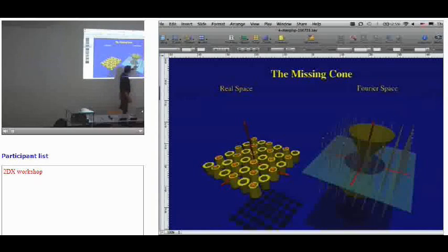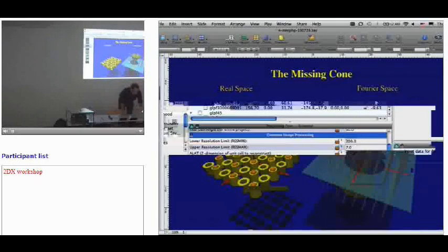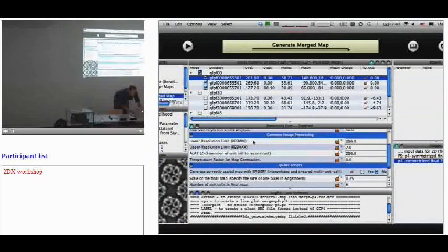And there's this Z star range variable which we have to put to a large value so that also a tilted plane along a lattice line up here still finds some reference point down there, even though it's not exactly correct, but it's better than not having anything at all. That's one of the sensitive MRC parameters here: the Z star range.